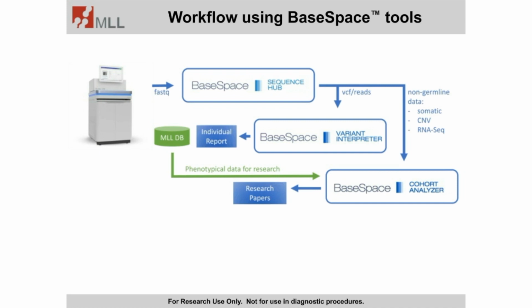And our application is the comparison of data obtained with whole genome sequencing to our orthogonal data, which we acquired during our routine operations I showed you at the beginning of the talk, such as cytogenetics, FISH, standard PCR or even targeted NGS sequencing of specific panels. And the interpretation in the Variant Interpreter is case by case, whereas for an aggregated view of the data, we also import the filtered VCF files to the Cohort Analyzer.